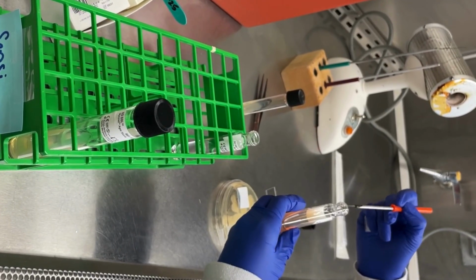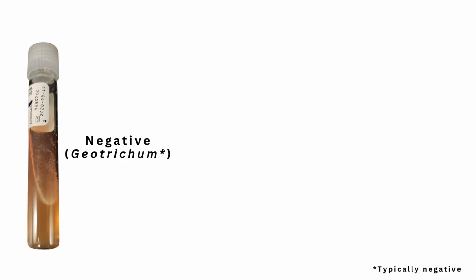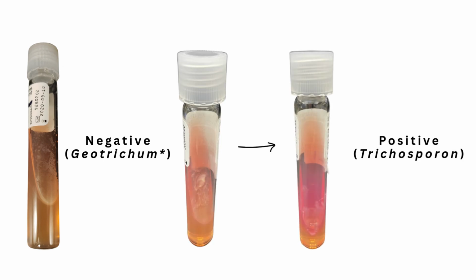Urea agar contains urea and phenol red as the pH indicator. Organisms capable of hydrolyzing urea form ammonia as a byproduct, thus turning the media alkaline. The pH indicator will turn the pale yellow media to pink-red in color.